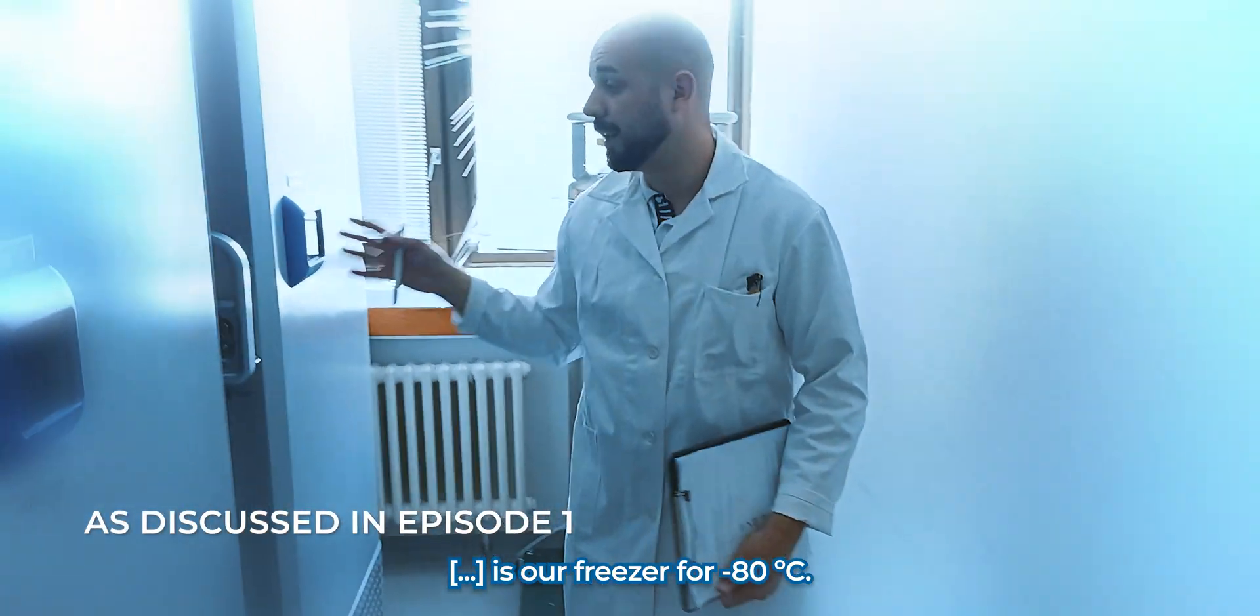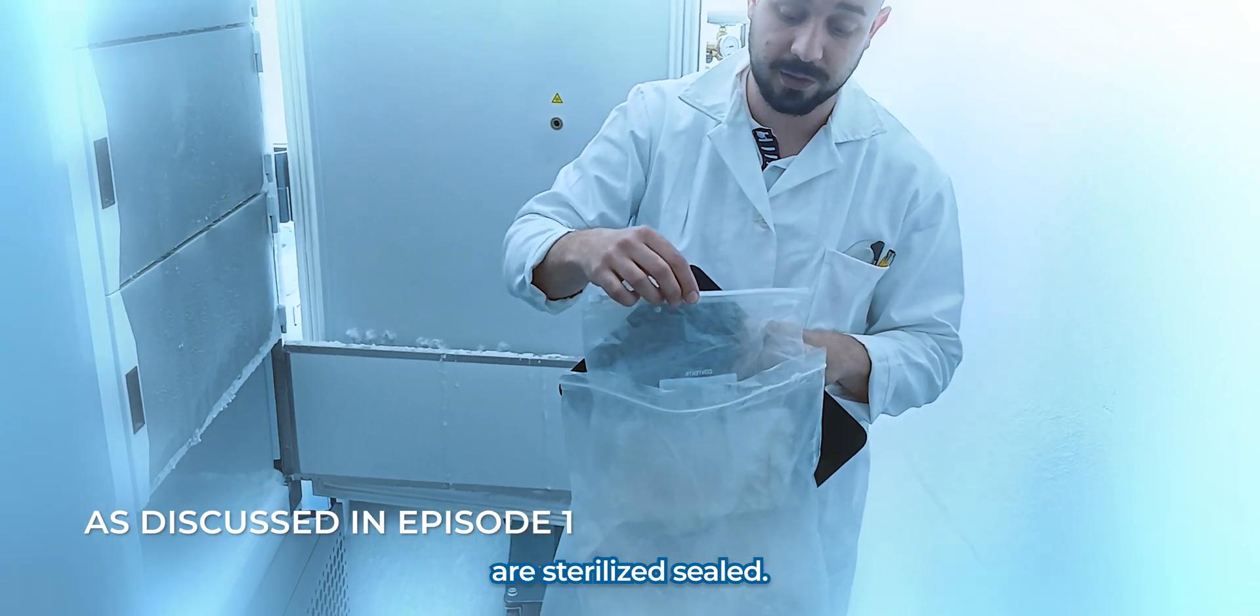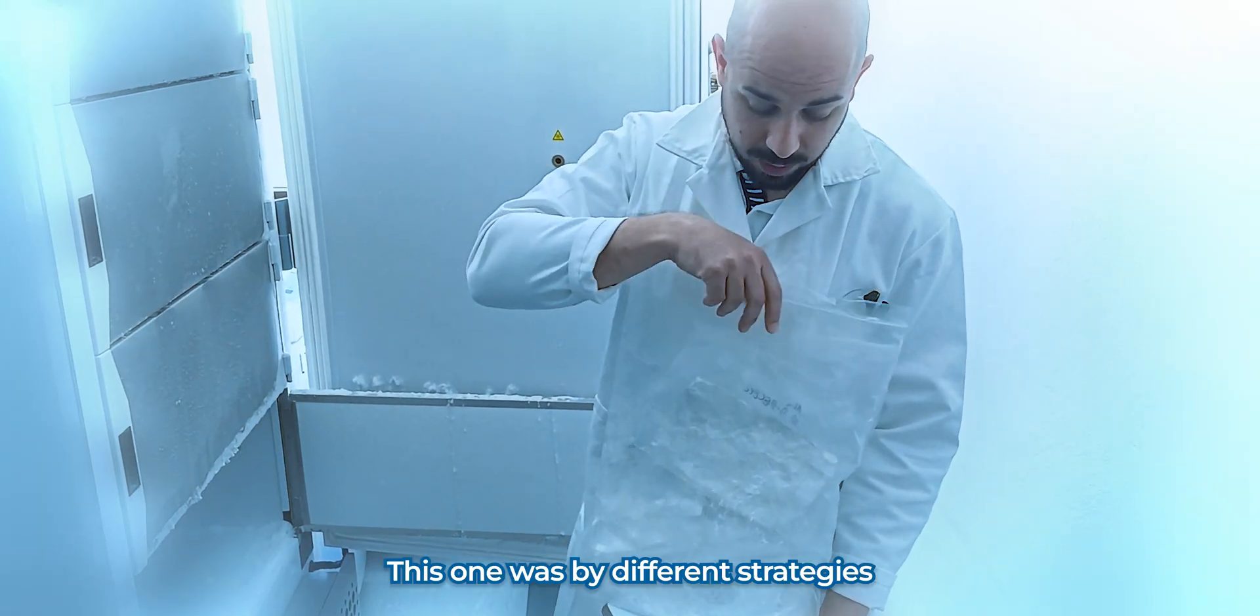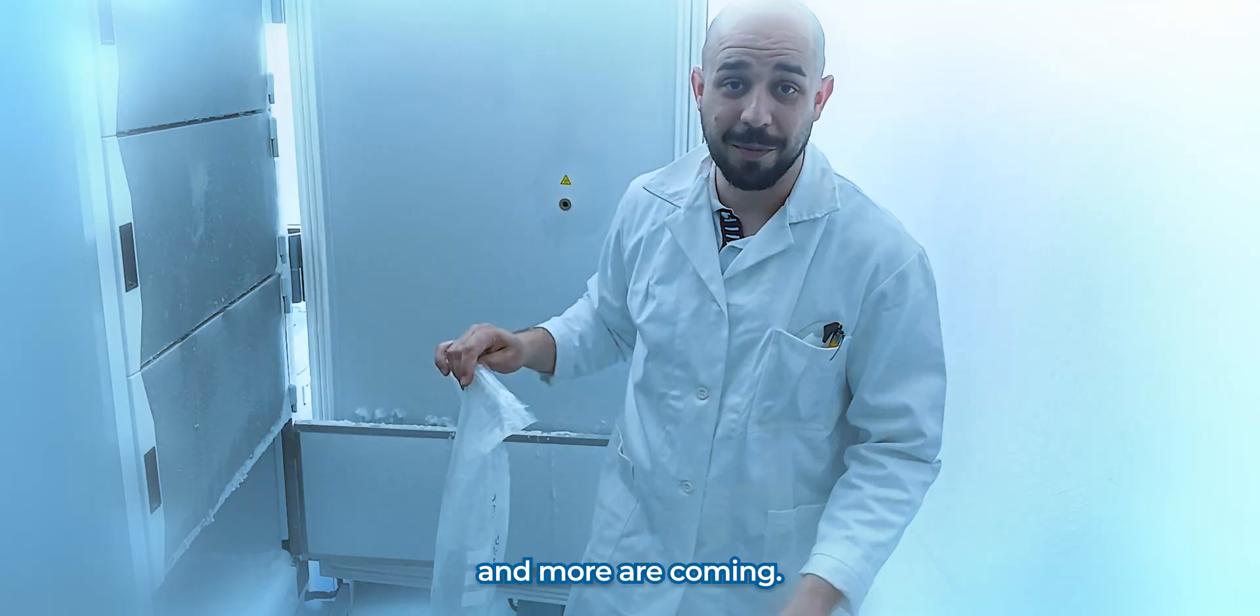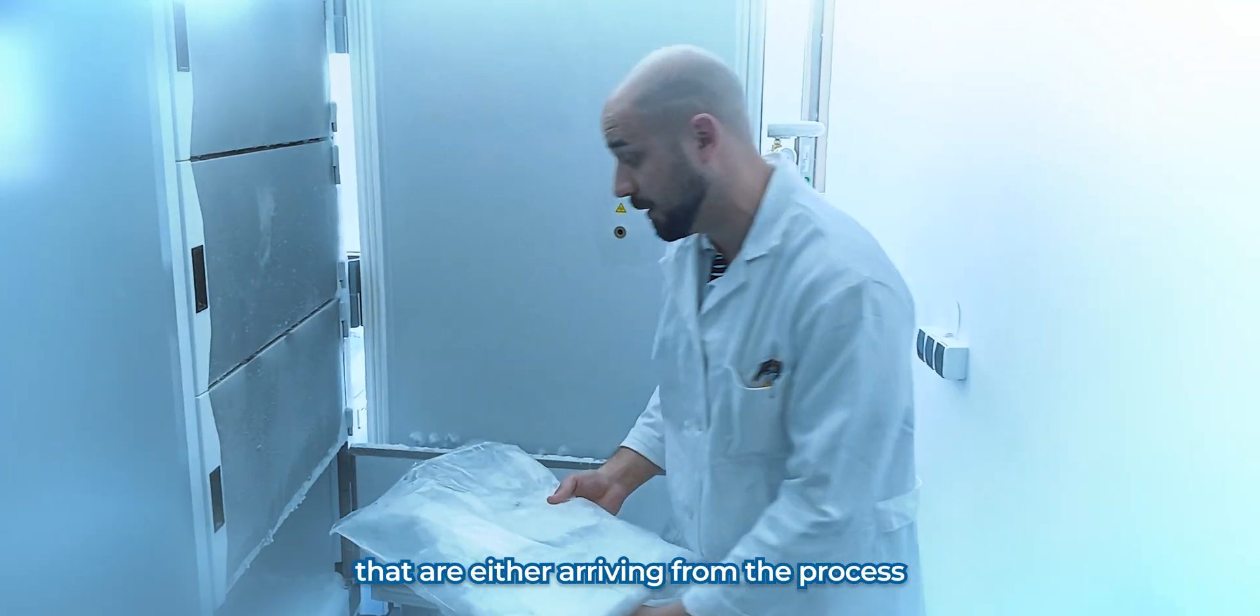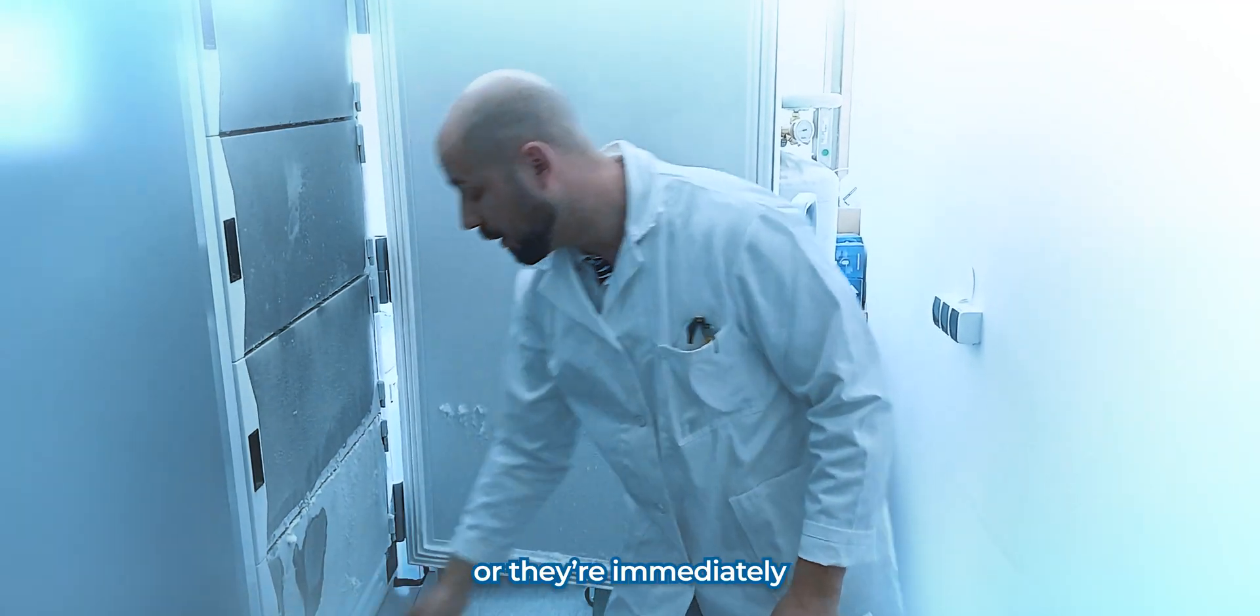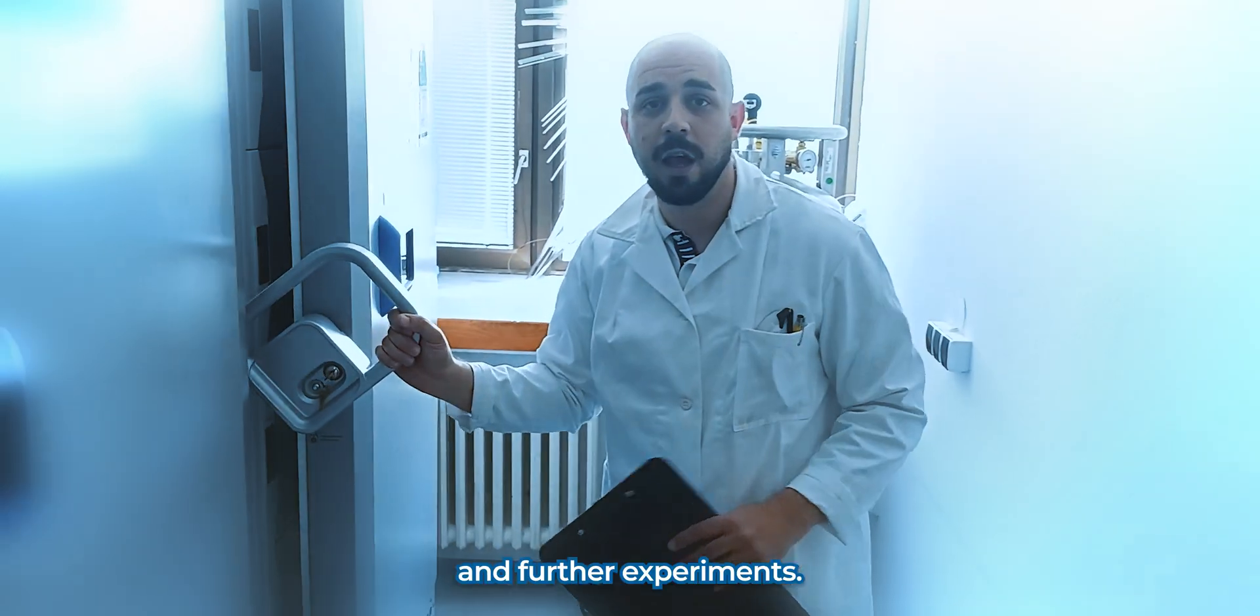We have a freezer for minus 80. So, within the bags, it's sterile and sealed. At the moment, there's multiple samples there. They're decellularized by different strategies, and more are coming. So, this is always full of samples that are either arriving from the process, and wait for further processing, or they're immediately taken to the different facilities or laboratories for further analysis and further experiments.